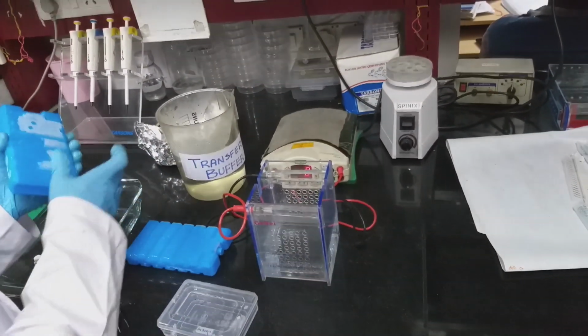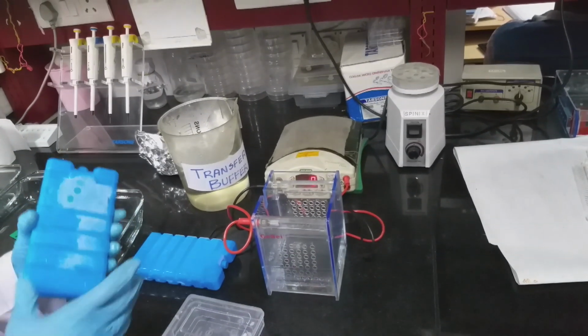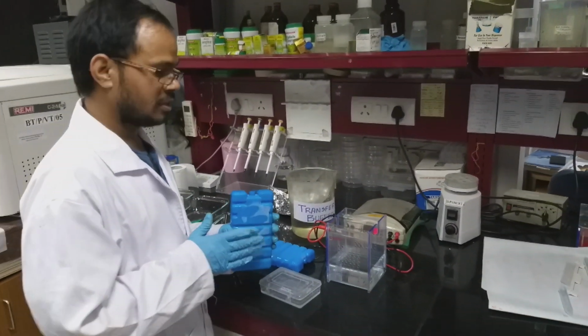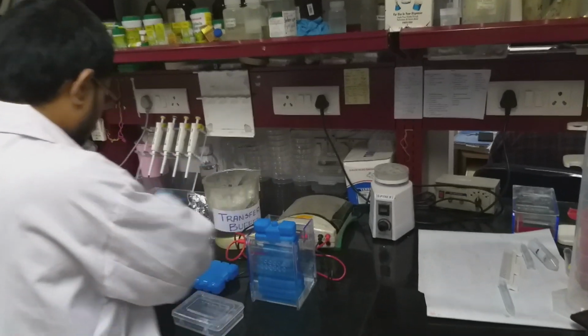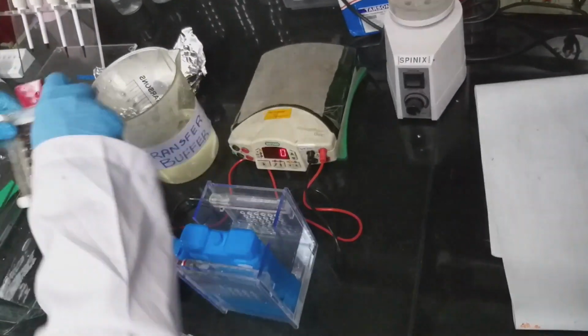If the chilling is not sufficient, then there may be heat generation. In order to prevent that, we will use this ice pack. It will keep the buffer cool till the end of the transfer. Once that is over, you directly take out the cassette.